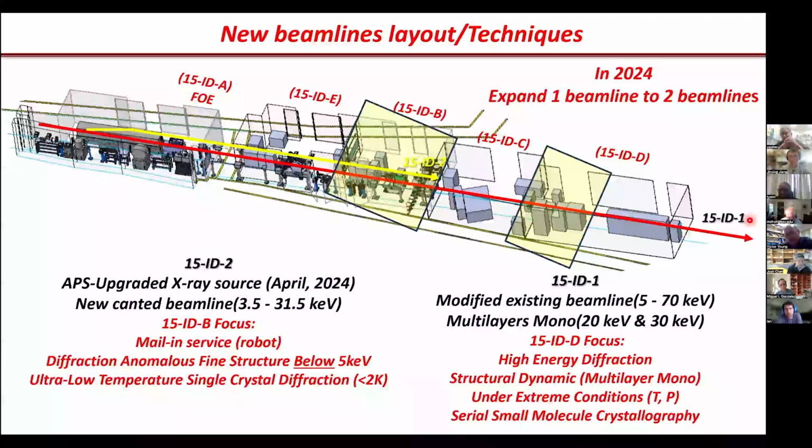That depends on the energy of the X-ray you use, right? Of course, at low energy you see more background coming out. But the good thing is that high energy can be focused. So I don't expect that much background for the high energy, especially for 40 keV or something. Okay. Right. Awesome.